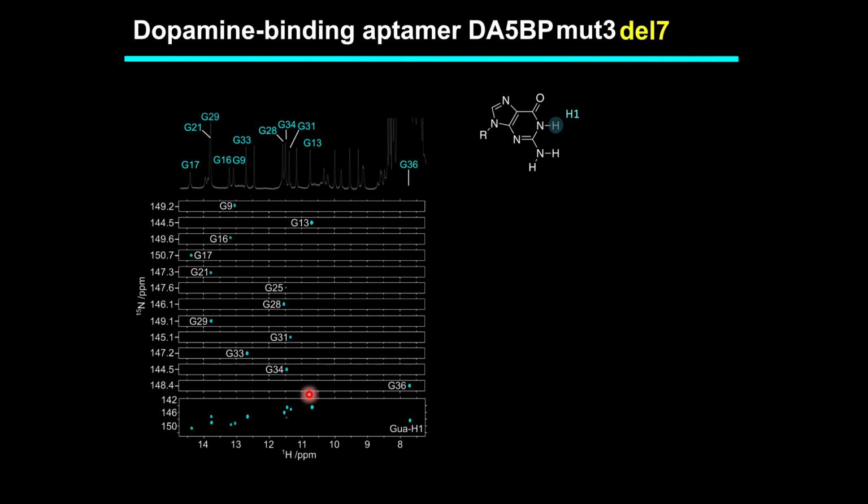And one of the other things about NMR, sometimes you are presented with these nice pictures. This is maybe not so big here, but there's lots of peaks. Each one represents a hydrogen. We can see this is the region where it's involved in base pairs, but you have to determine which ones they are. There's a lot of experiments to do this.